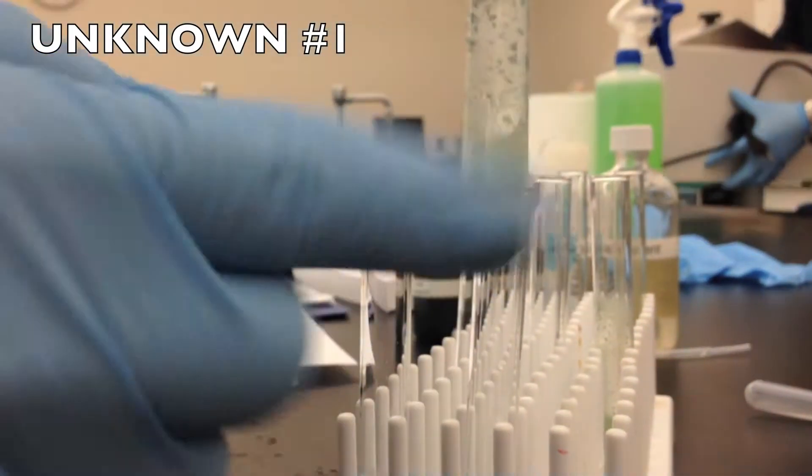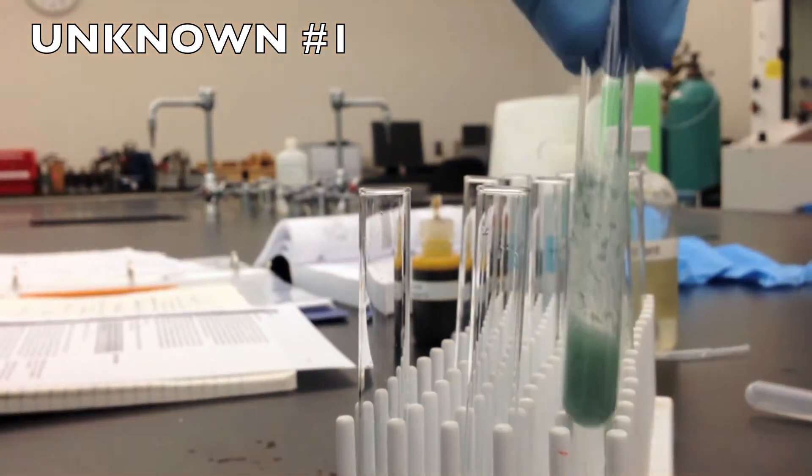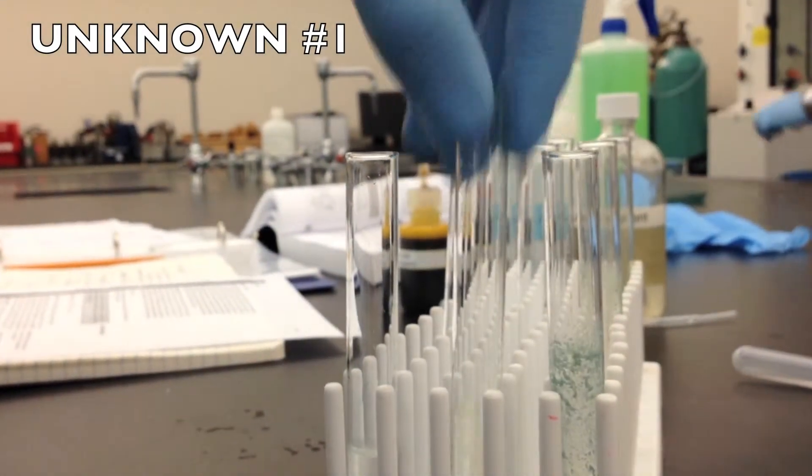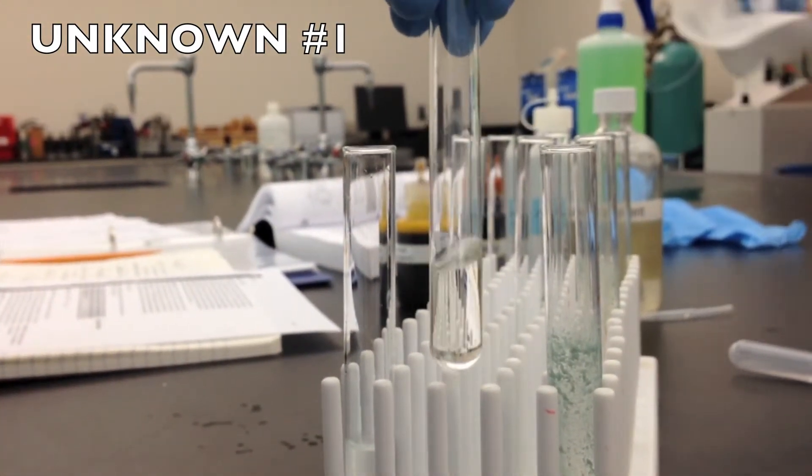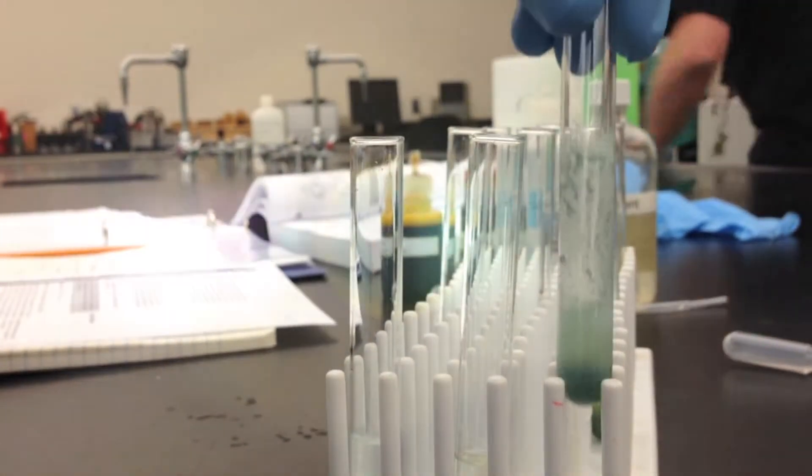And then for the third test, the chromic acid test, we got a positive reaction, which we can assume is either a primary or secondary. And since it did not react positively with the Lucas test, we know it's not a secondary. So it must be a primary.